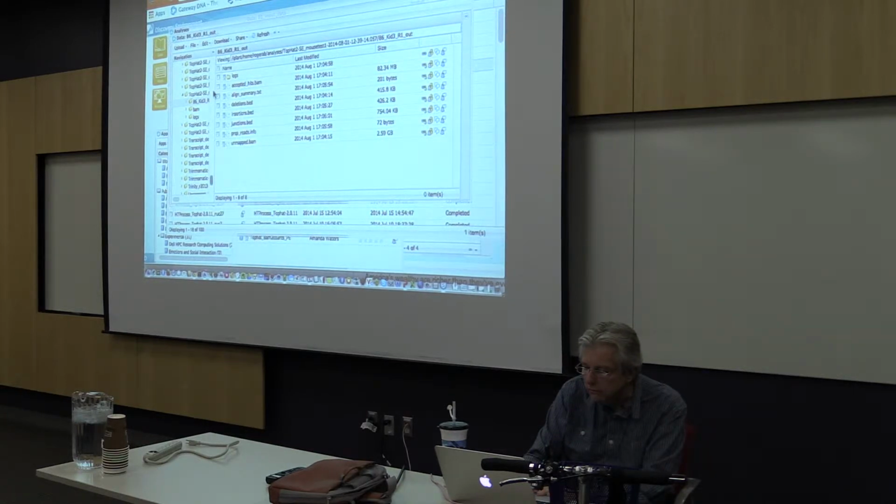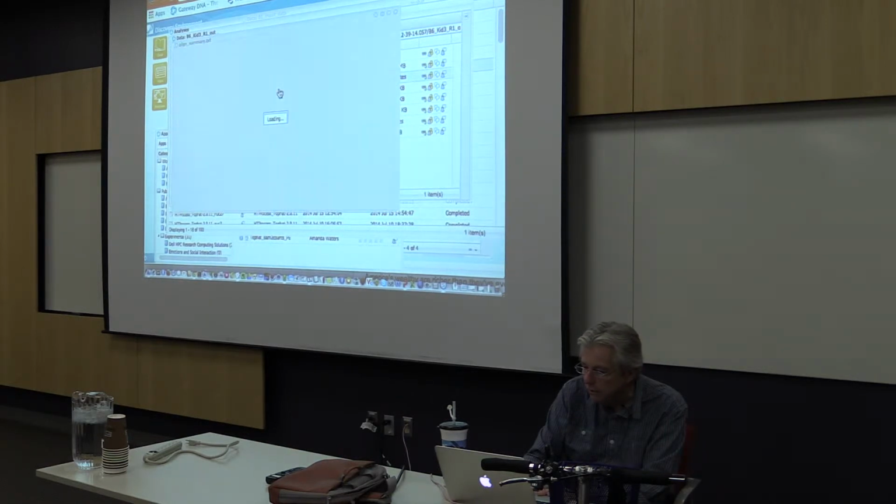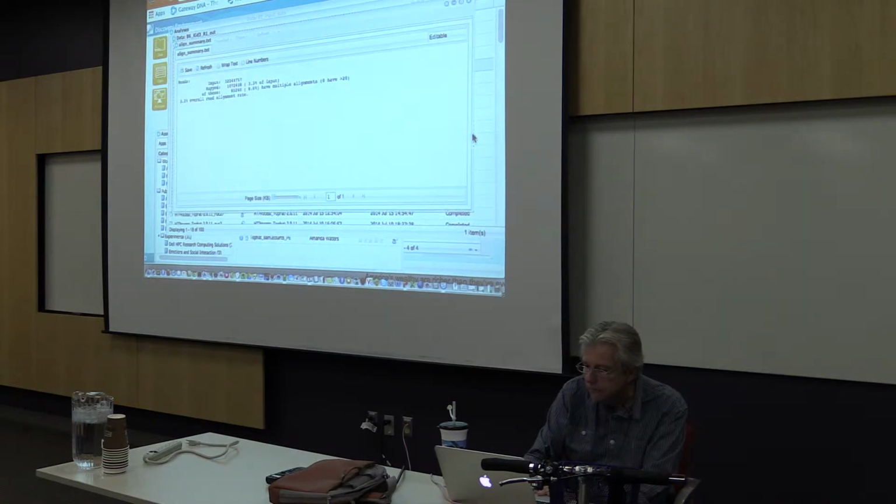This output corresponds to that particular read file. And you have these various files, including, you can see, junctions mapping, insertions, deletions, unmapped reads, and then you have your hits, and you have a summary information.